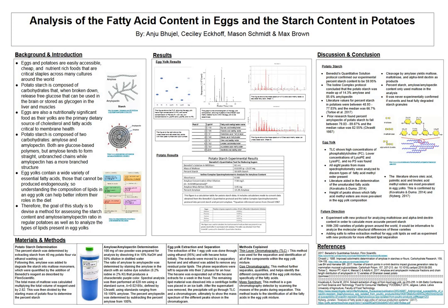So I will be talking about the materials and methods and results for the potato part of the project. The potato part of the project involved two procedures with two separate results. One was to specifically quantify just the percent starch that was in the potato flour we had, and the other was within that starch to determine what the ratio of amylose to amylopectin was.